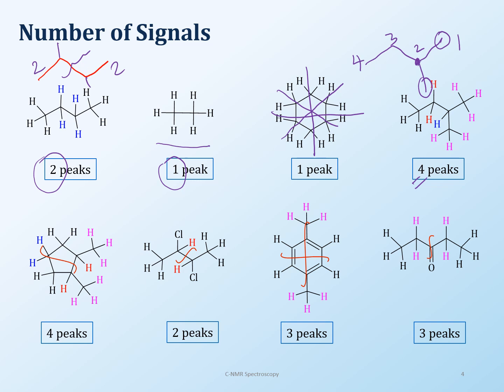Now the next one here, remember this was like this, and if you don't remember, here it is: 1,2-dimethylcyclopentane. In this case, again, go ahead and draw the symmetrical line, which I have here as the curved line. Then just count every carbon separated by that line, so 1, 2, 3, 4. That's how it is. This one is easy enough to do, 1, 2, and then this is 1, 2. The next one is also easy to do.